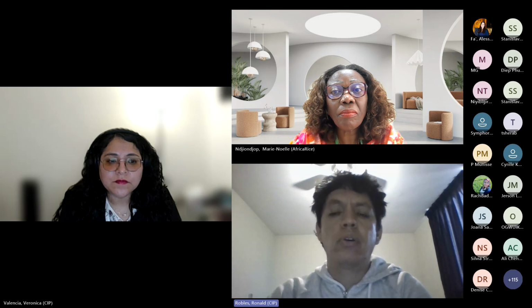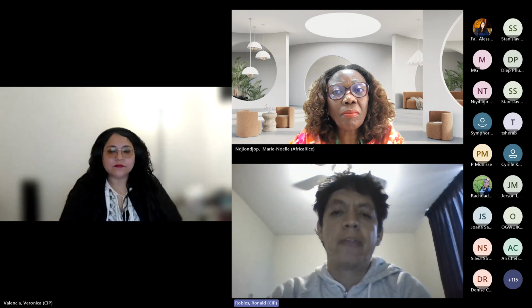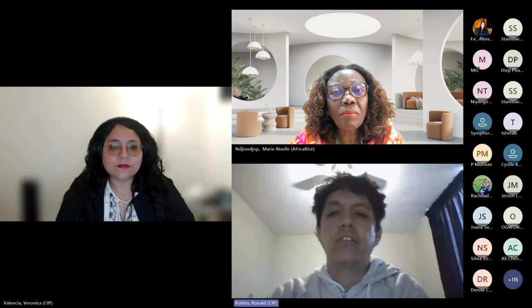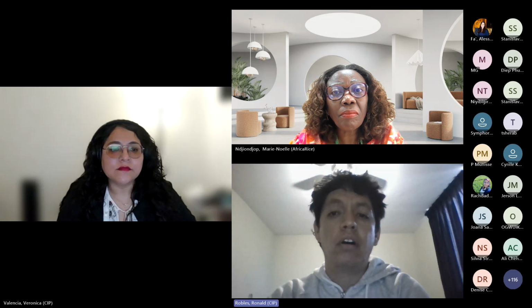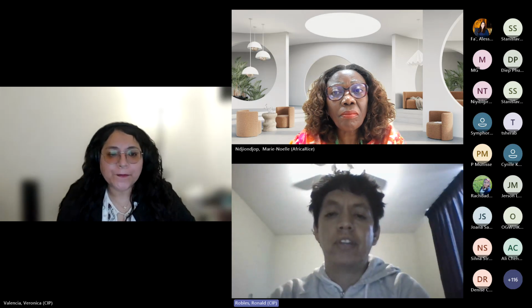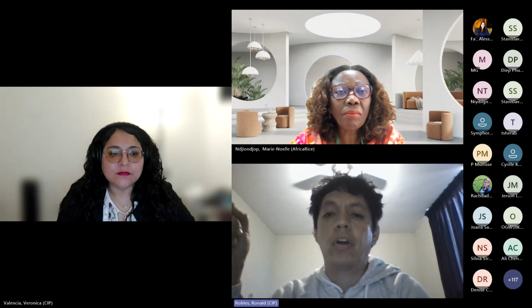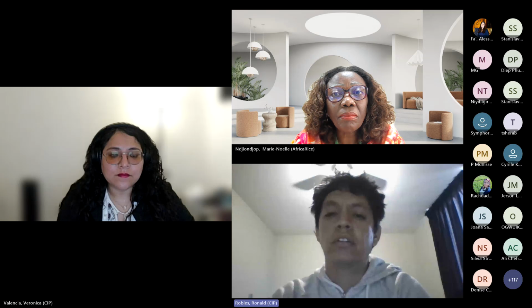But there are also crops that are conserved as a population of seeds, for example. In those cases, you have to take care of the consideration. If you want to extract as a batch, a bulk of samples to represent the diversity of your accession, in these scenarios it is acceptable to make the extraction in one batch, and only if it will be analyzed as a bulk.